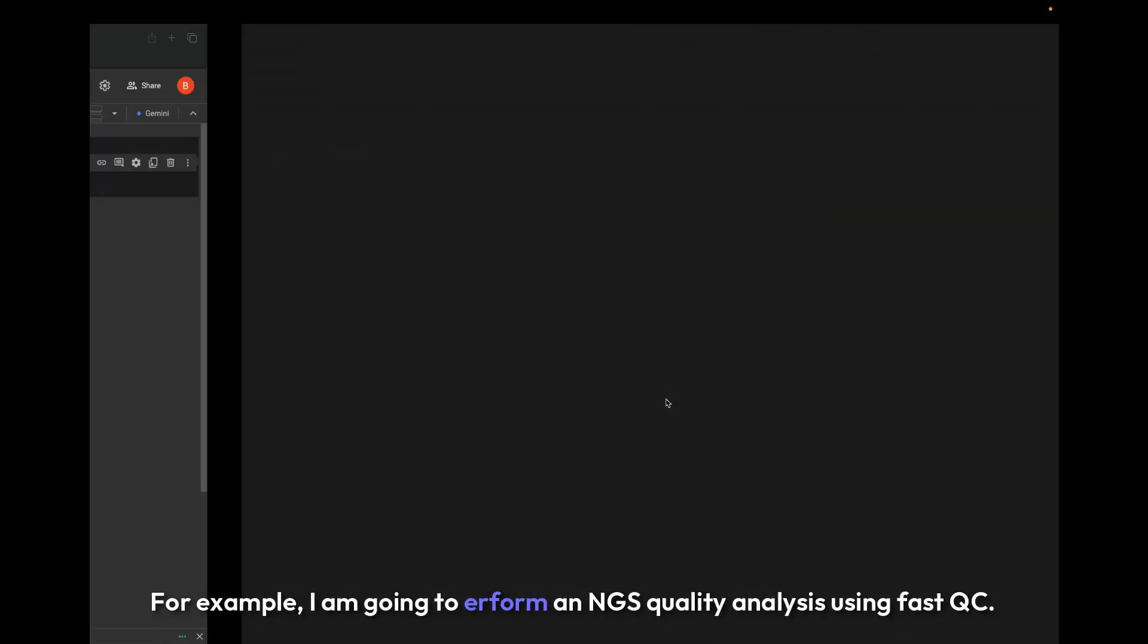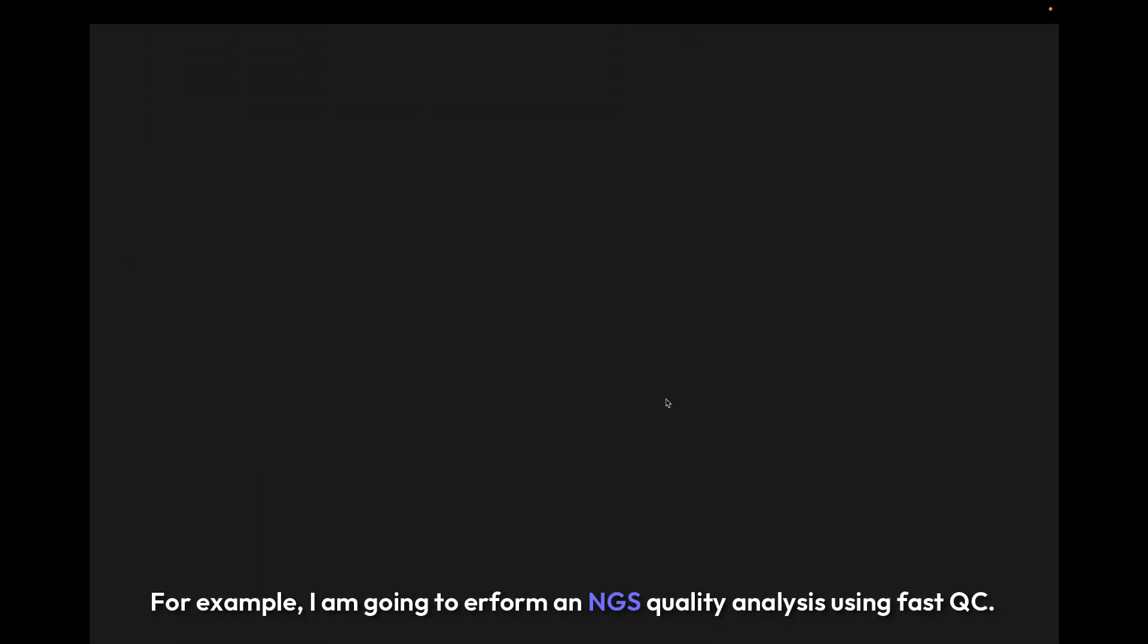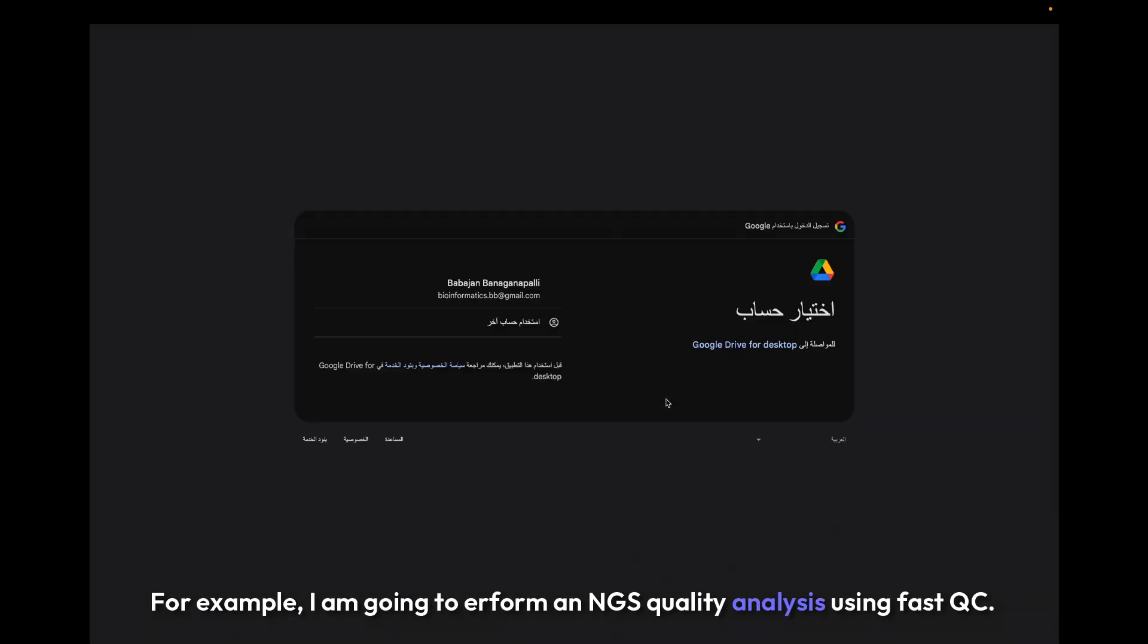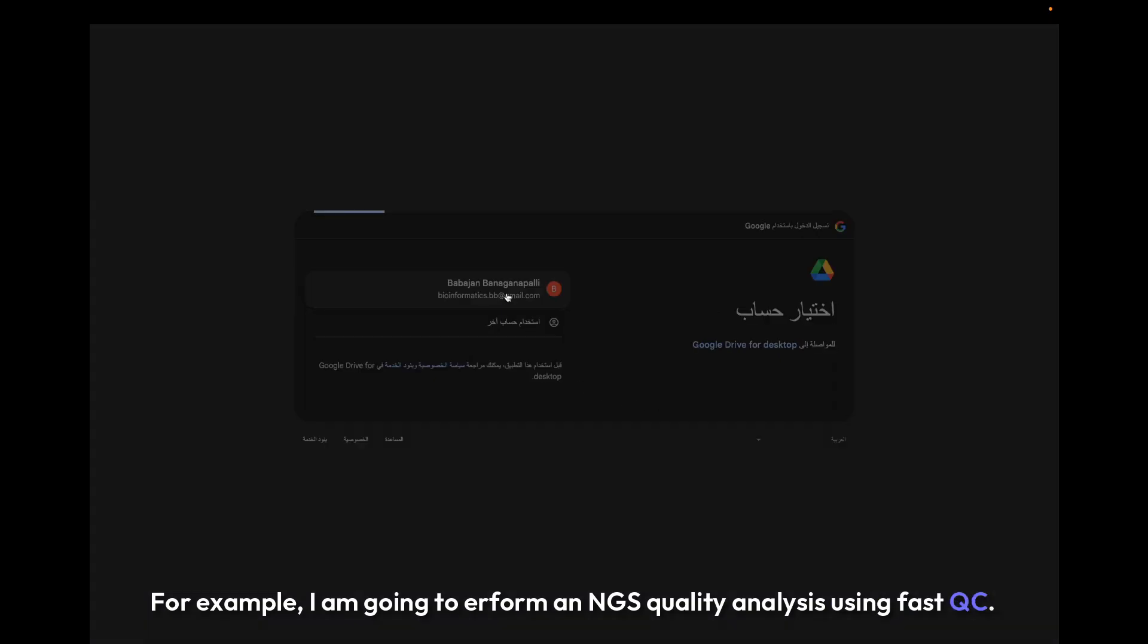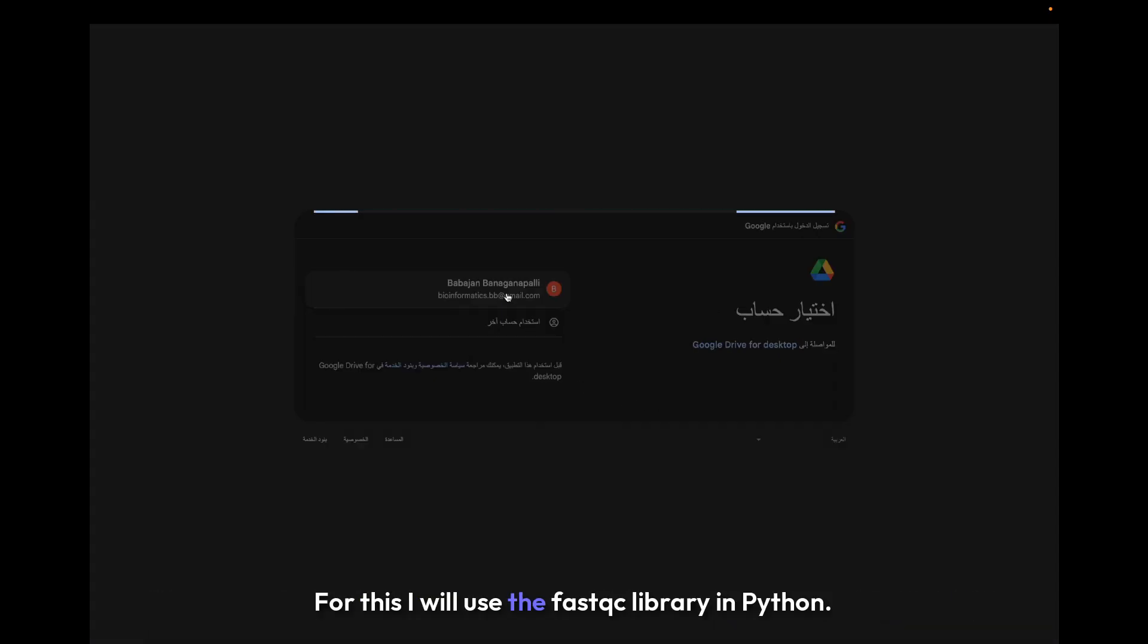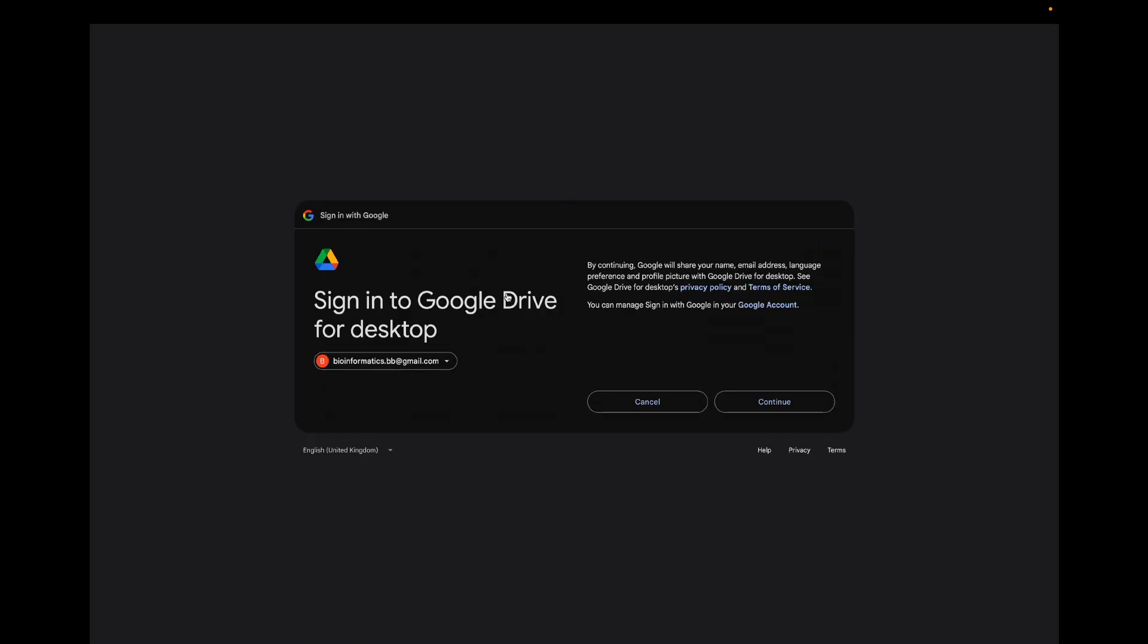For this, I will use the FastQC library in Python. We will also do some basic statistical analysis using Google Colab.